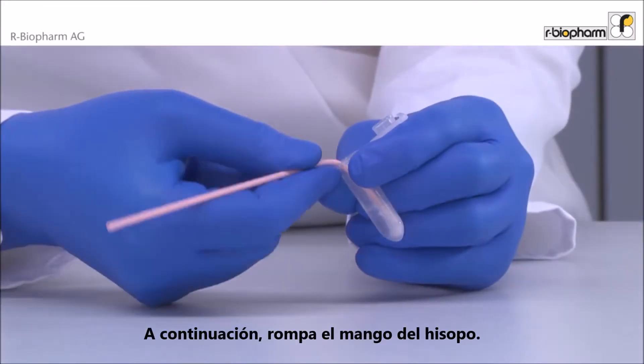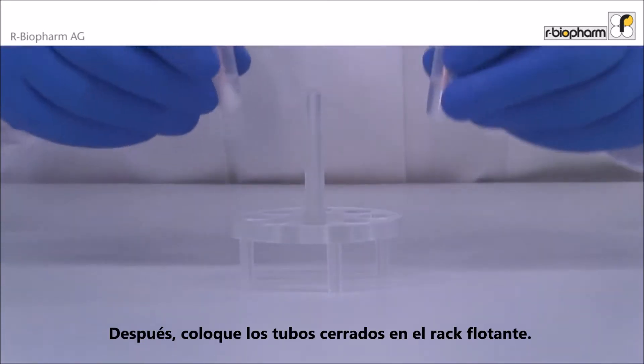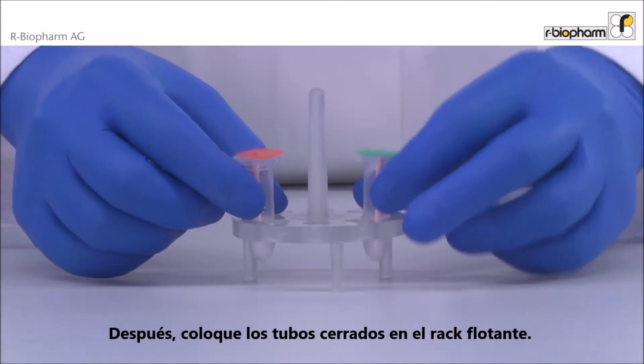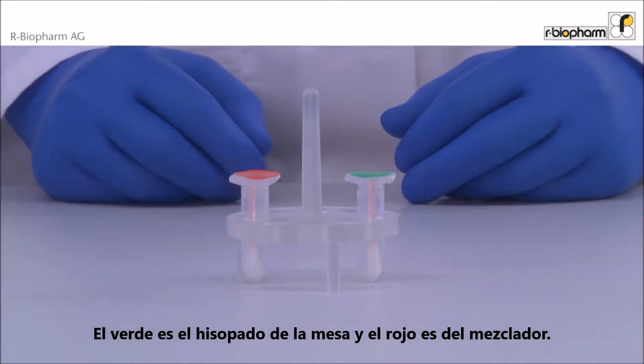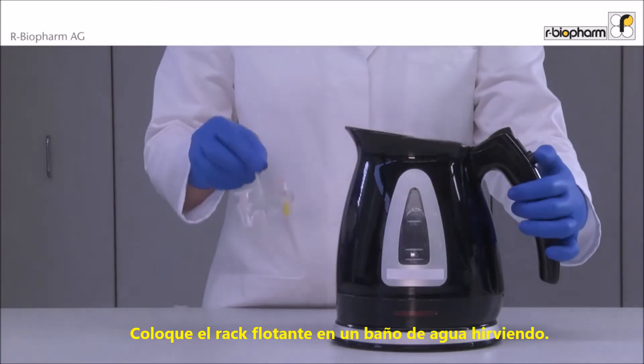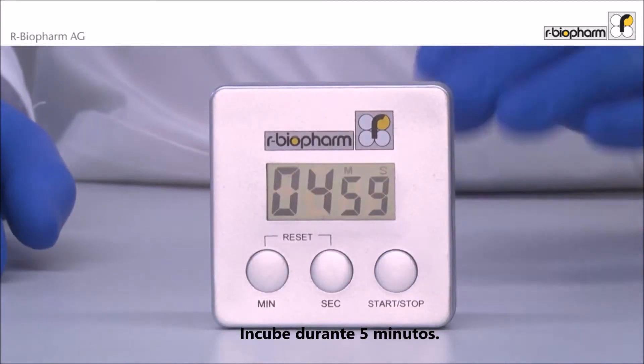Next, the upper end of the stick is broken. Then insert the closed vials into a floating rack — green is the surface swab and red is the blender swab. Insert the floating rack into boiling water and incubate for five minutes.